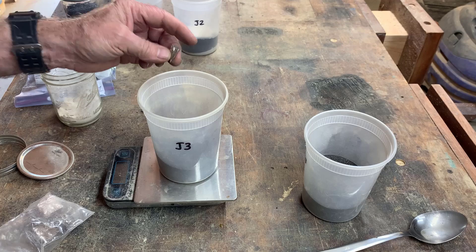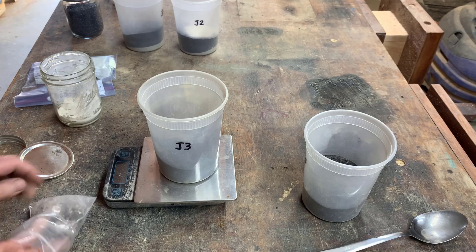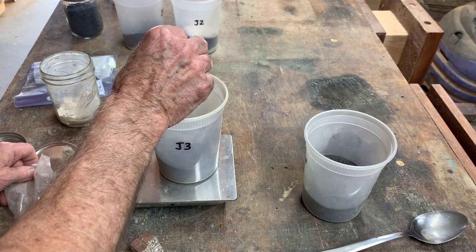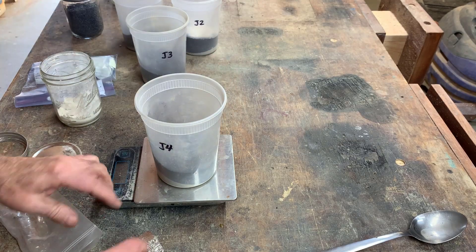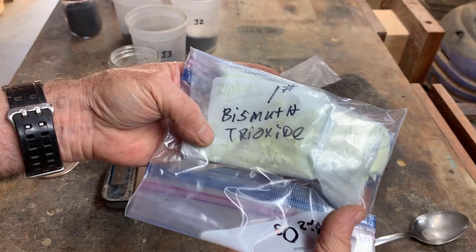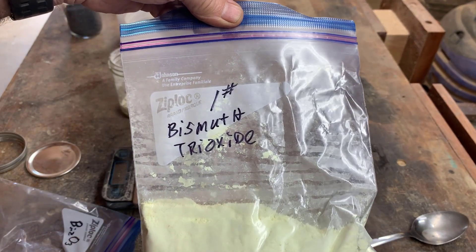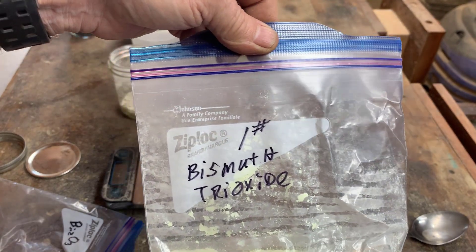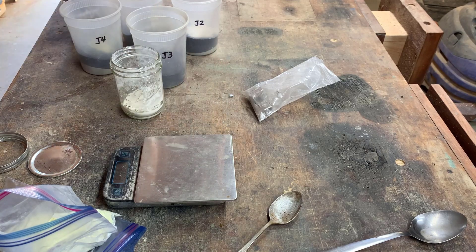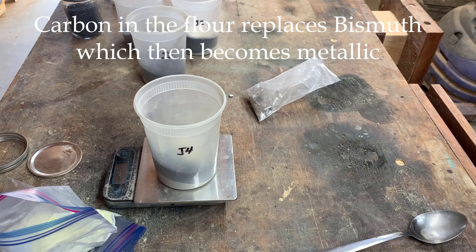J3 gets metallic bismuth — I'm going to try to get 25 grams of that. J4 is going to get bismuth trioxide. I suspect there's silver contamination in here and I'm going to try to figure that out in this run. Flour goes in here too to reduce the bismuth trioxide — 10 grams.